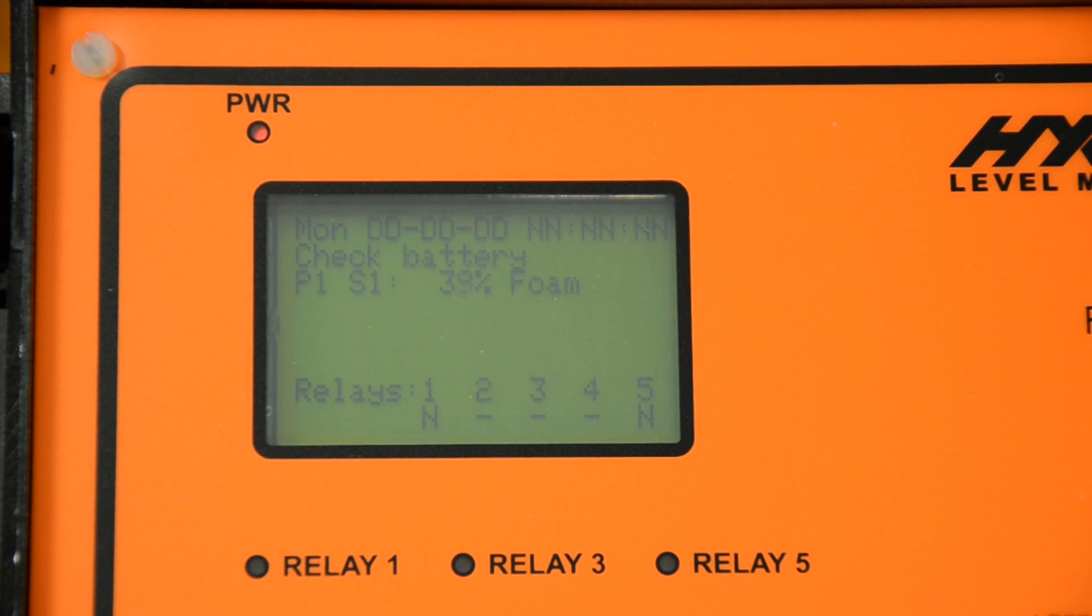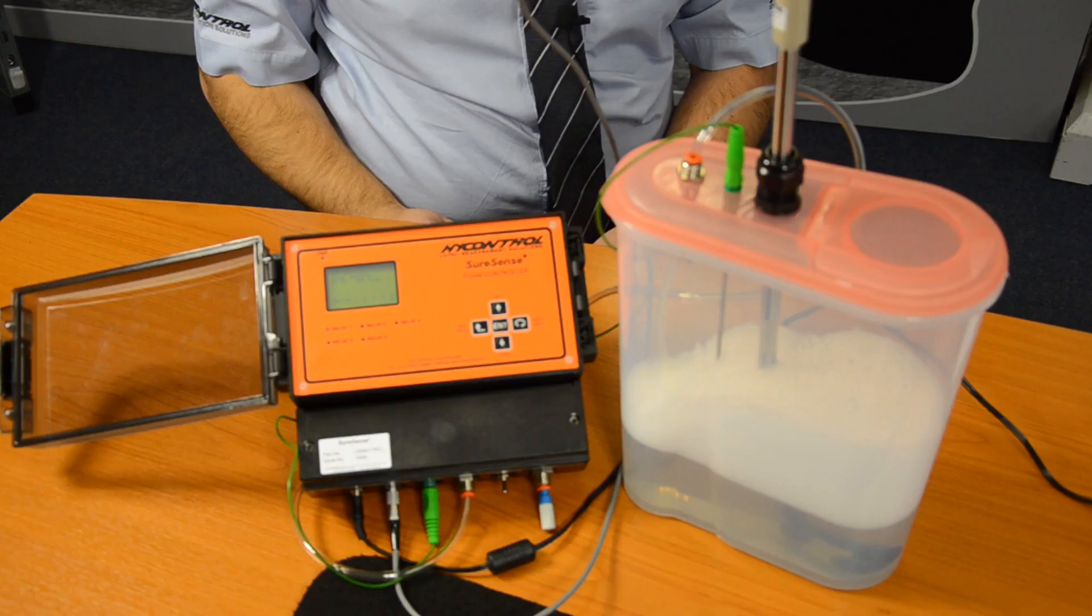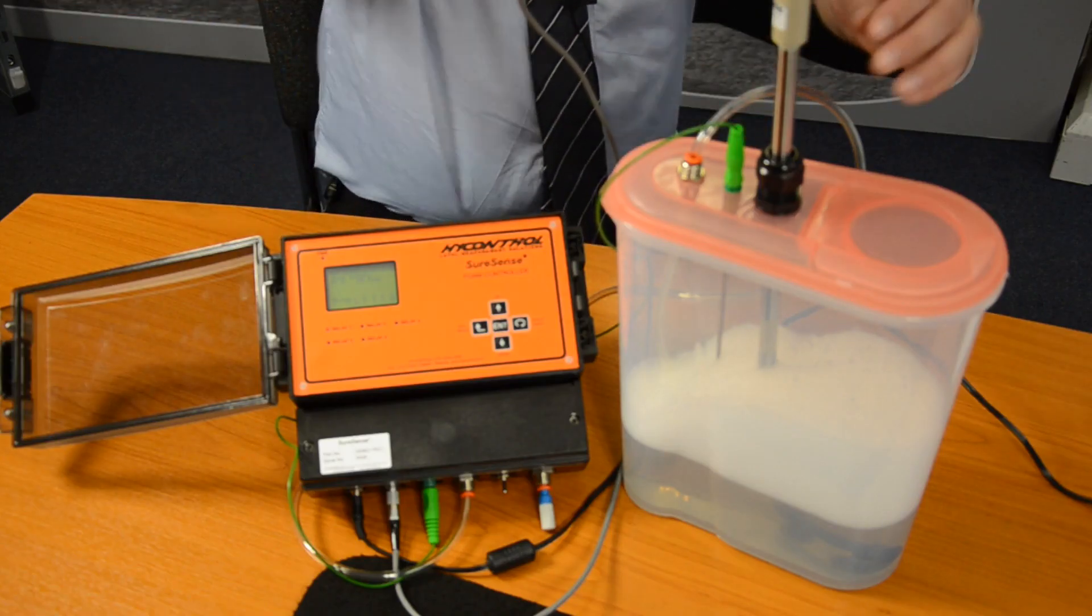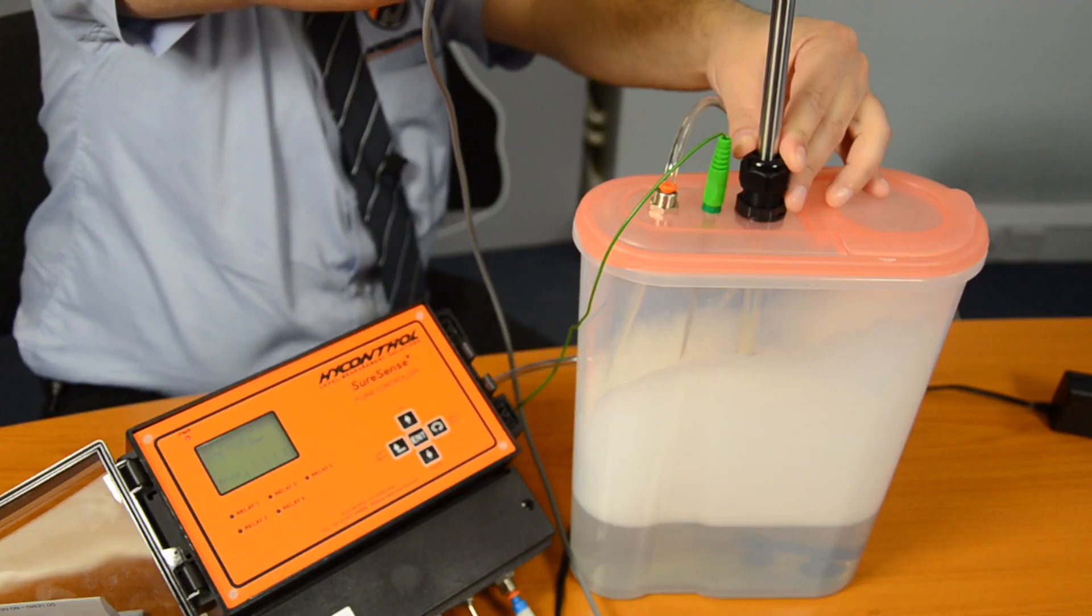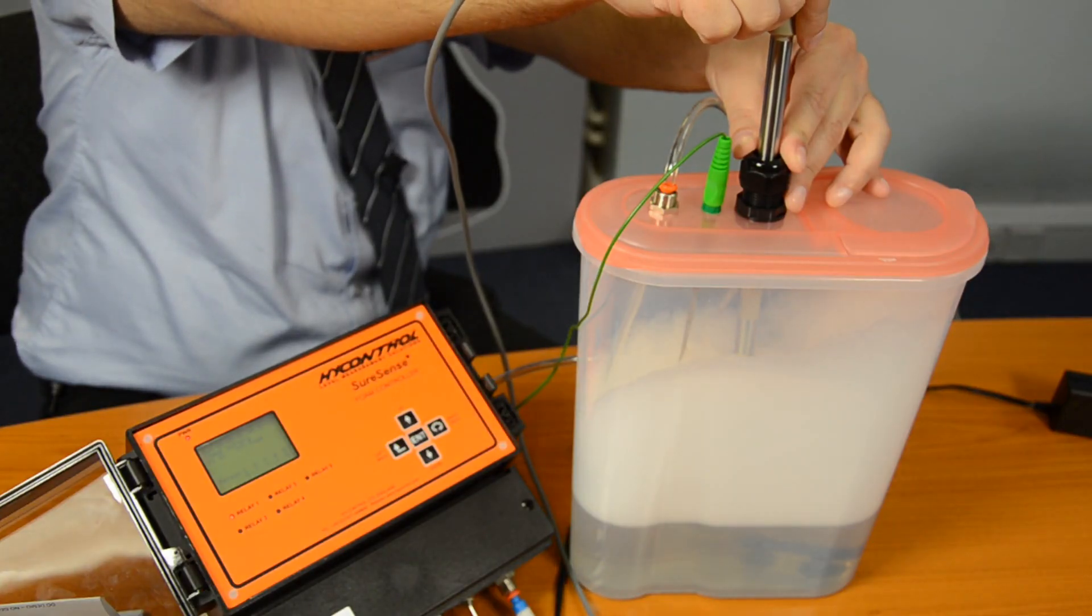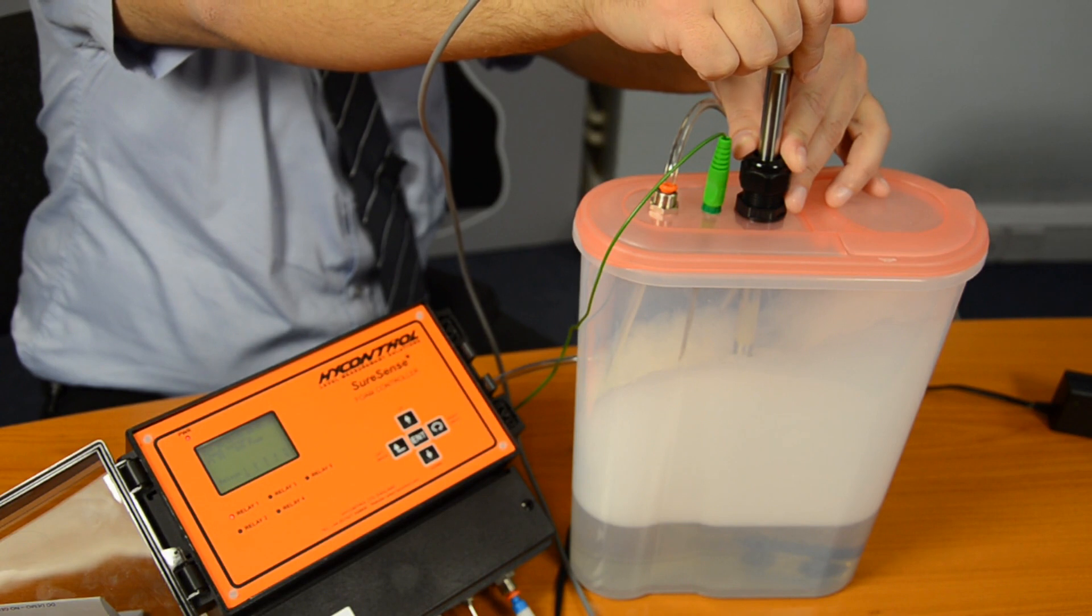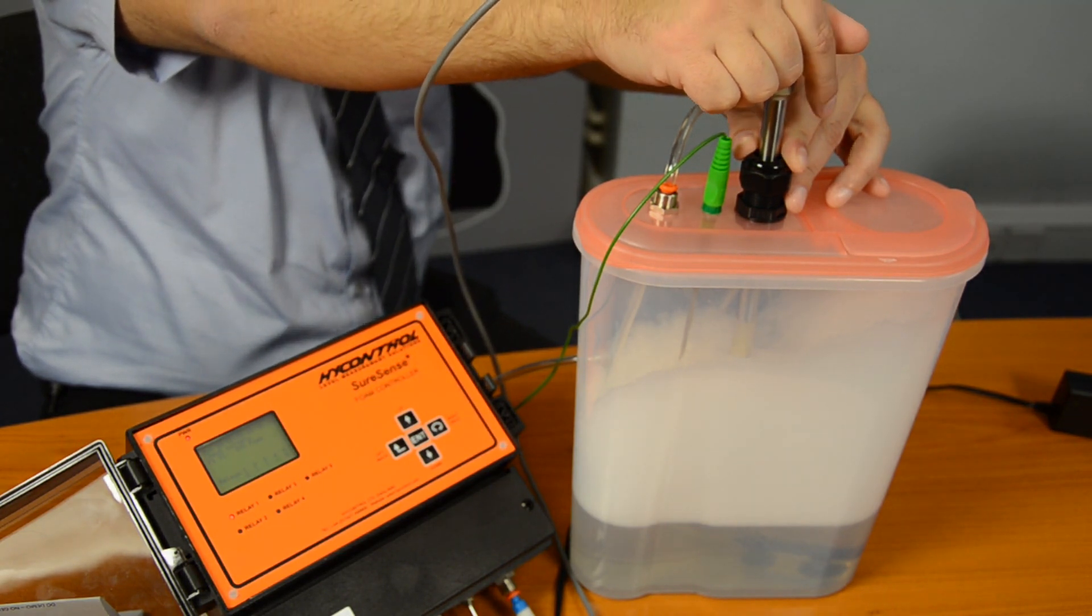Foam is usually made up of around 1% liquid and 99% air. This is the main reason why we need a specific sensor developed for just this purpose. As you can see, the closer to the surface the stronger the reading, and this gives us a rudimentary foam density reading on the controller.